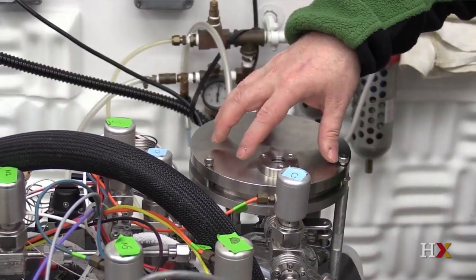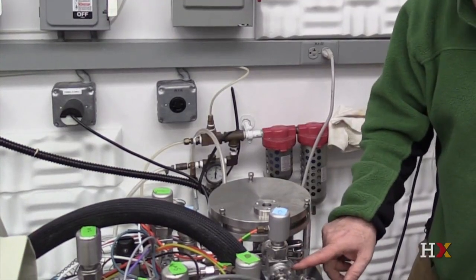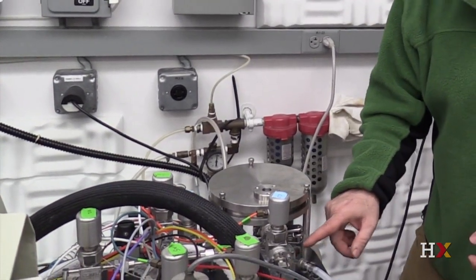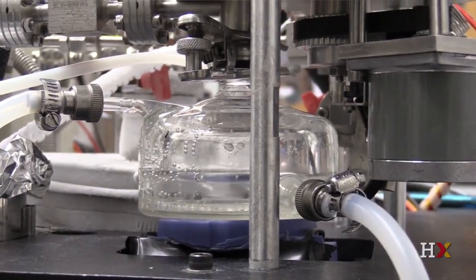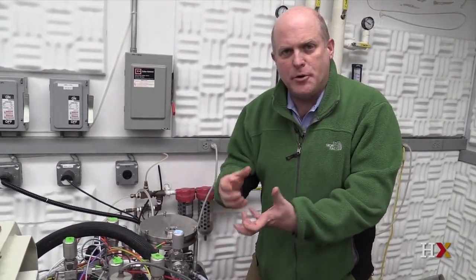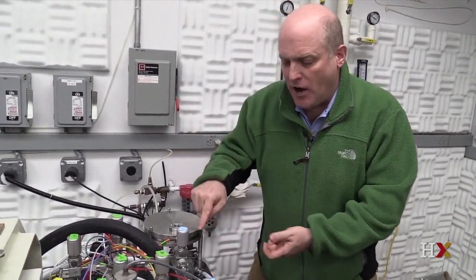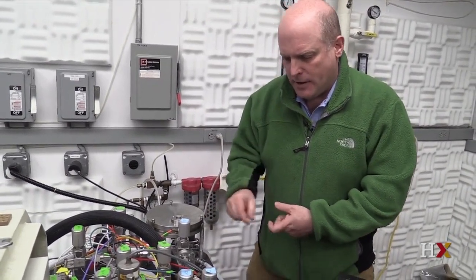One at a time, the computer advances the carousel and the capsules drop into this vat down here. This is a glass vessel filled with phosphoric acid. What happens in the acid is the calcium carbonate reacts with the acid, it fizzes and ultimately produces carbon dioxide, which comes off of here along with a little bit of water from that reaction with the acid.